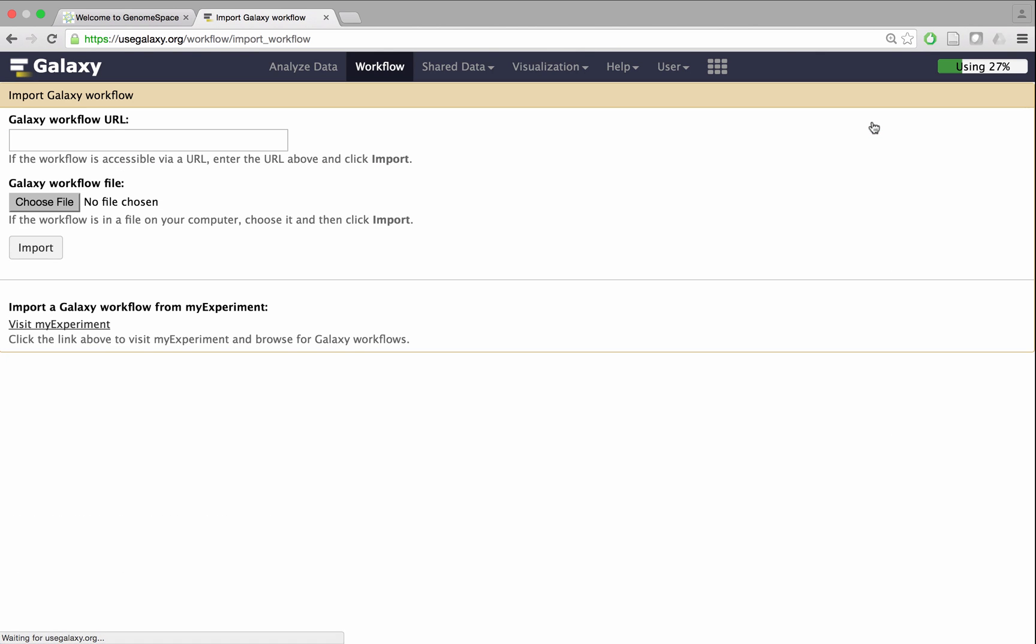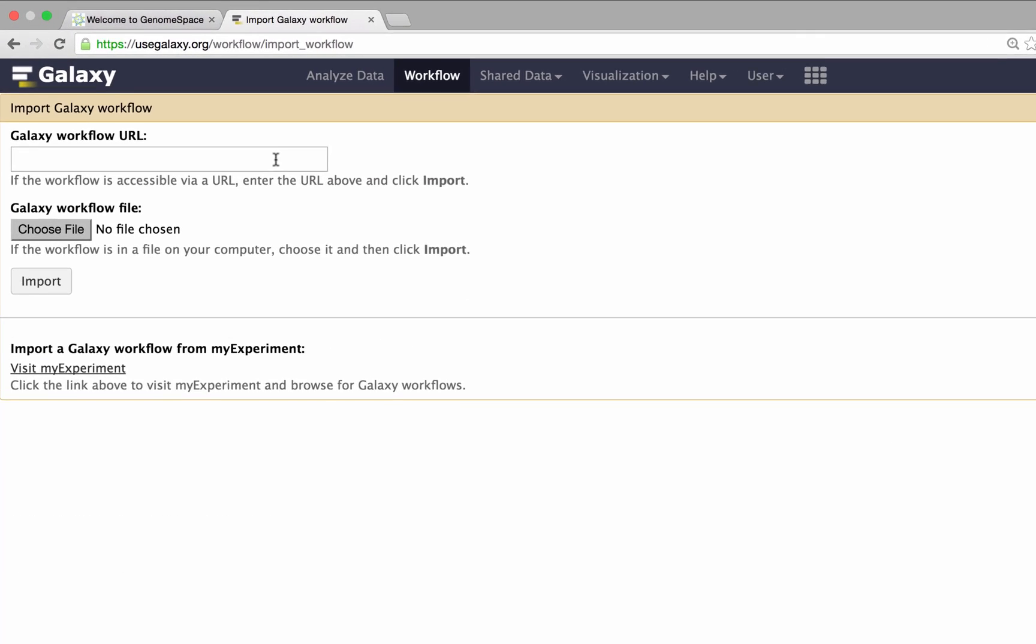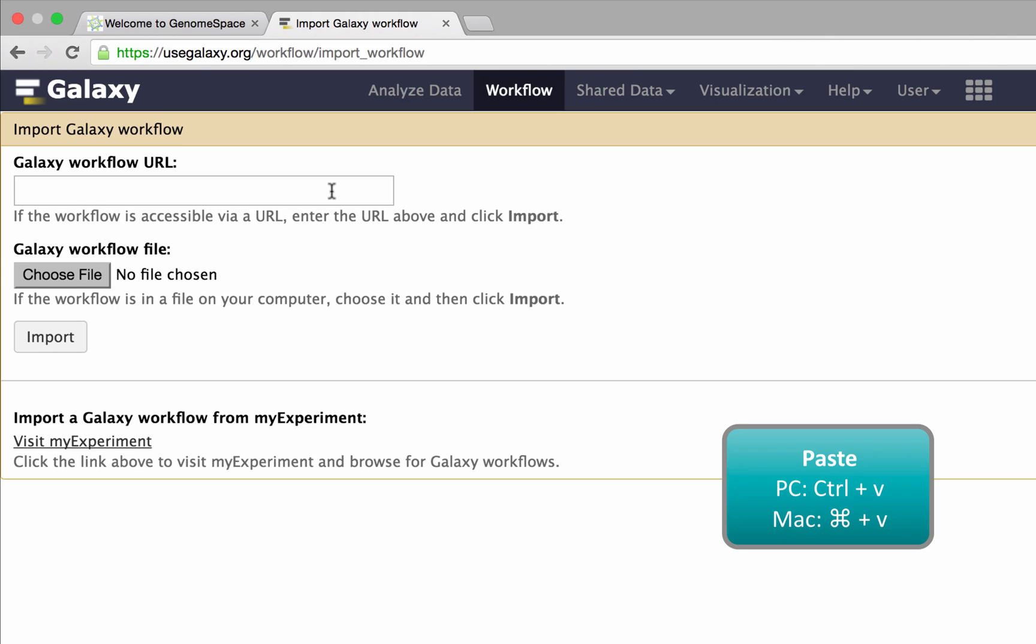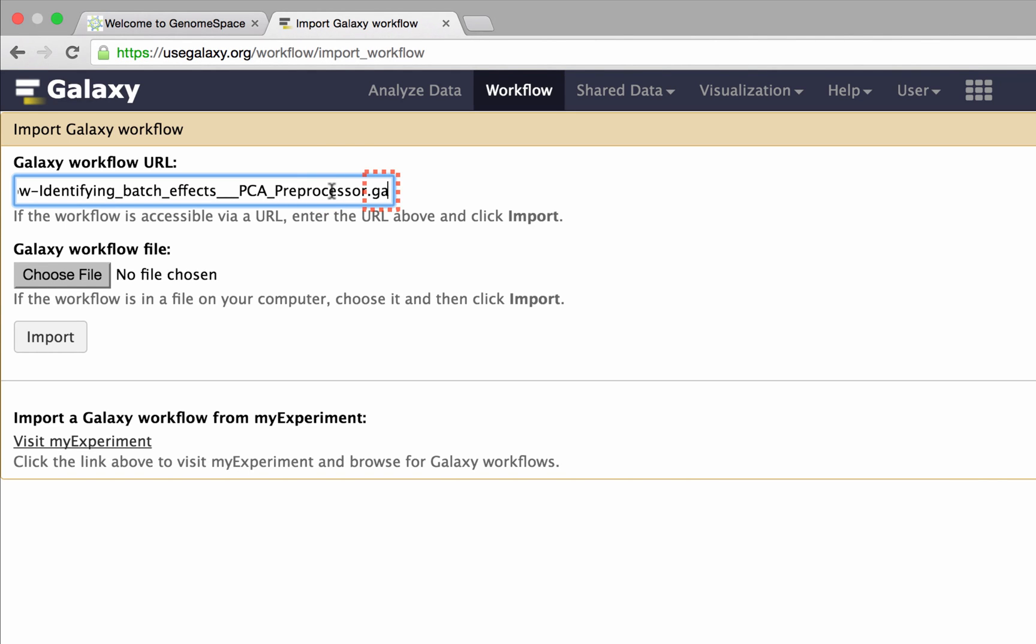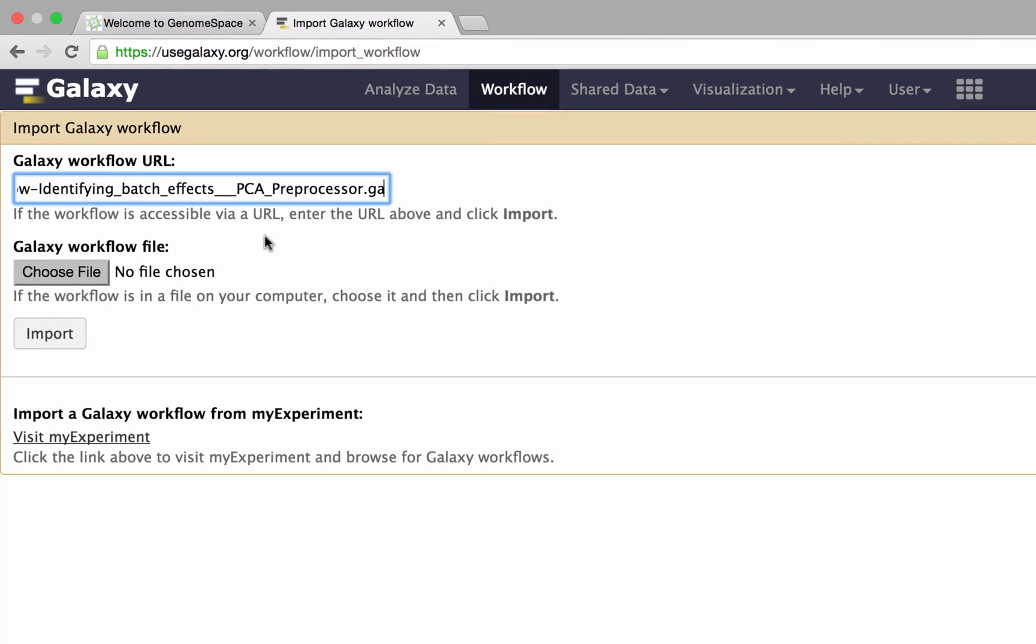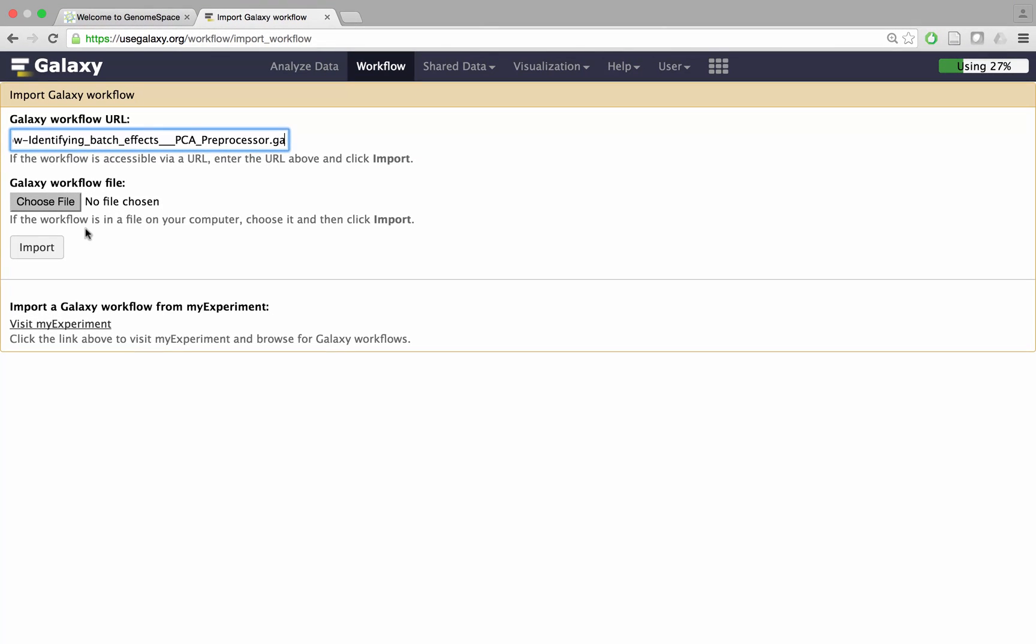Under the Galaxy workflow URL field, press Ctrl-V to paste in the URL. Notice that all Galaxy workflow files have the same extension .ga. Click Import to import the desired workflow.